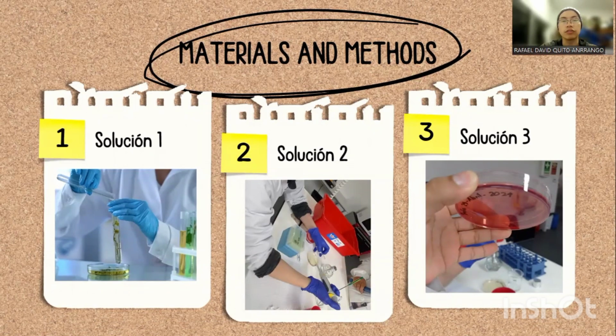3. Analysis of results. For regular surfaces, the number of colonies obtained, CFU, will be multiplied by the dilution factor and by the volume of diluent solution used in sampling, 10 milliliters, and will be divided by the area of the surface sampled, 10 square centimeters.